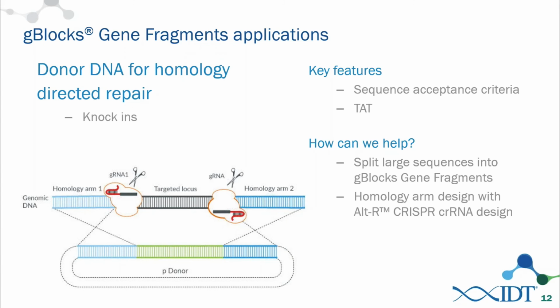Okay, let's see here. This person actually asked two questions. The first one was that they want to synthesize something that's 1,400 base pairs, and they want to know about online tools for optimizing that sequence. But the second part, they're asking about synthesizing something that's 1,400 base pairs that contains modifications.